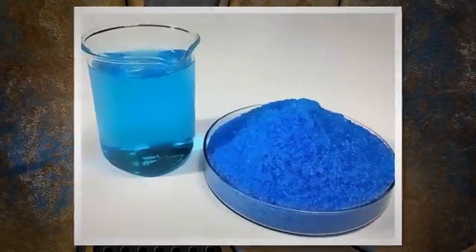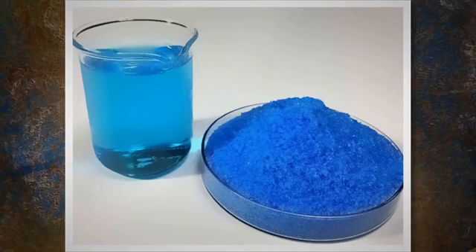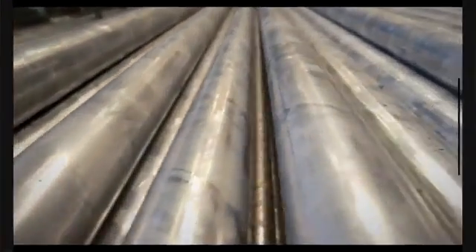Rinse the surface fully and take care not to disturb any copper deposit until the part is completely dried. Then perform visual inspection for the presence of any copper deposit on the test area. Any copper deposit indicates the presence of free iron.